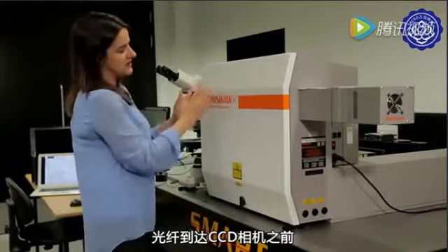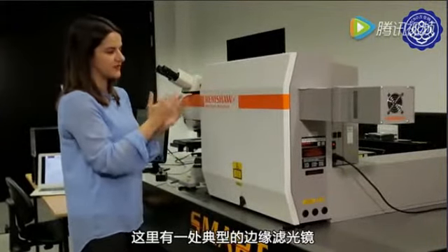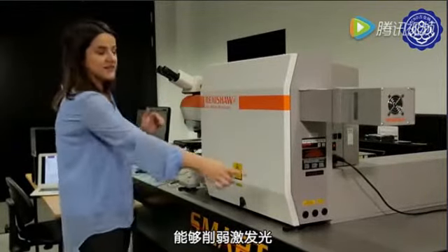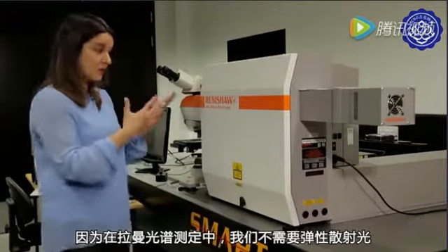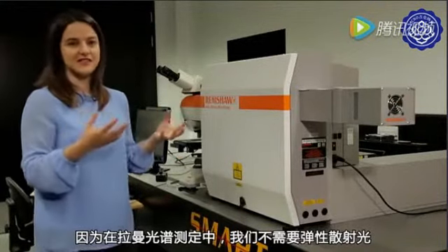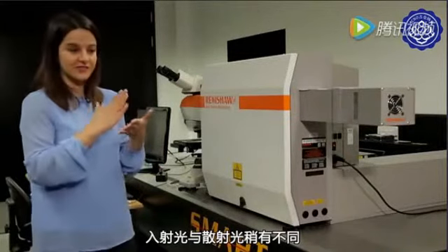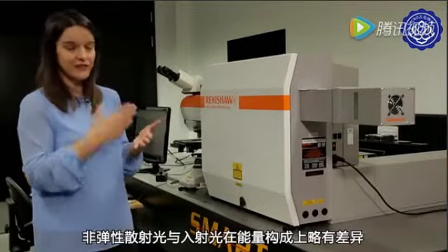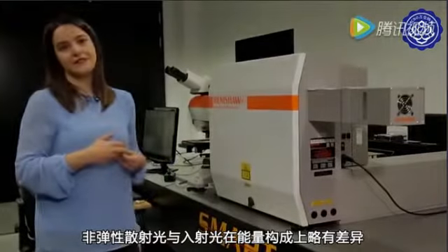Before reaching the CCD camera, there is a filter here, typically an edge filter. There are different types of filters, but typically an edge filter cuts the excitation line, because in our Raman experiments we don't want to measure the elastically scattered light, the incident light, but the inelastically scattered light, which has a slightly different energy compared to the incident light.